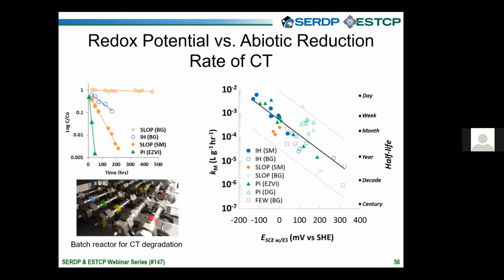We also measured reduction kinetics of carbon tetrachloride by aquifer solids. Here we use carbon tetrachloride as our probe contaminant. The experiments were conducted in rotating tubes using a high solid to water ratio to simulate actual porous medium conditions. Example degradation kinetics are shown in this figure. We can see a nice first order reaction pattern for 4 different solids collected from 4 different areas.